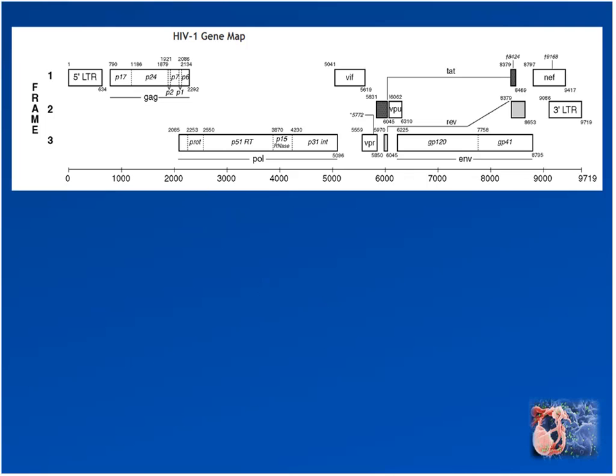Since no presentation regarding sequencing of HIV would be complete without presenting a map of the HIV genome, here is that slide. Here's the HIV reverse transcriptase gene.